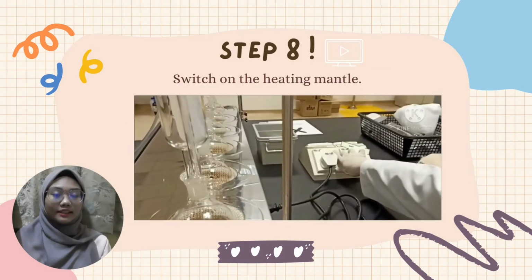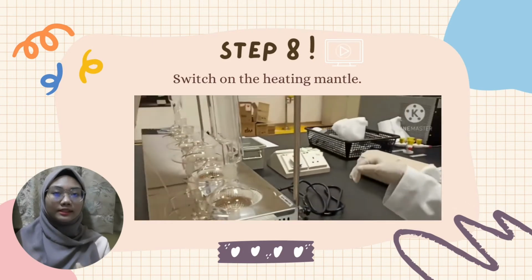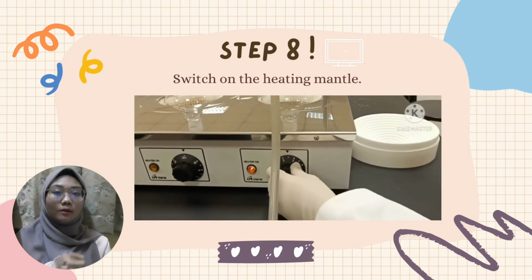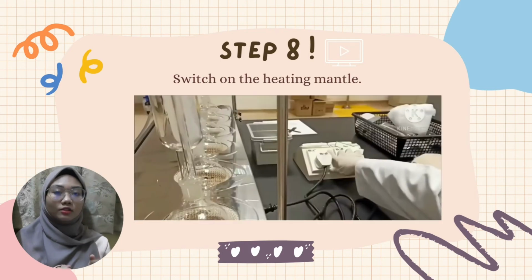Step 8 is to switch on the heating mantle. Make sure to raise the laboratory stand until the round bottom flask is surrounded by the mantle and carefully boil the ethanol. Observe it and adjust the settings in case the boiling rate is too fast or too slow.